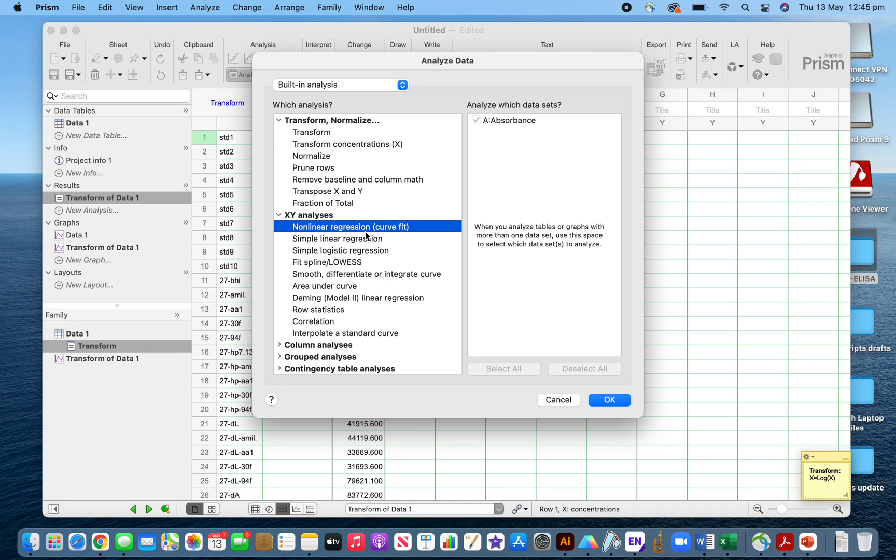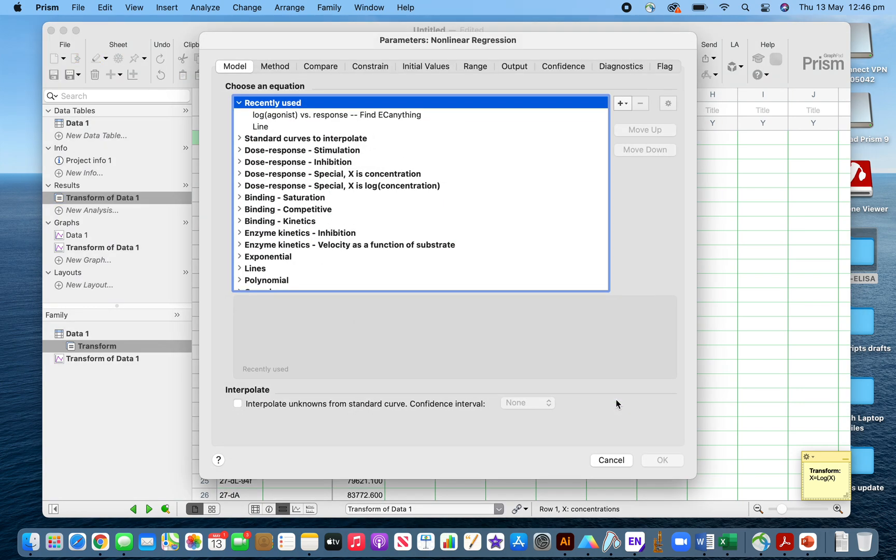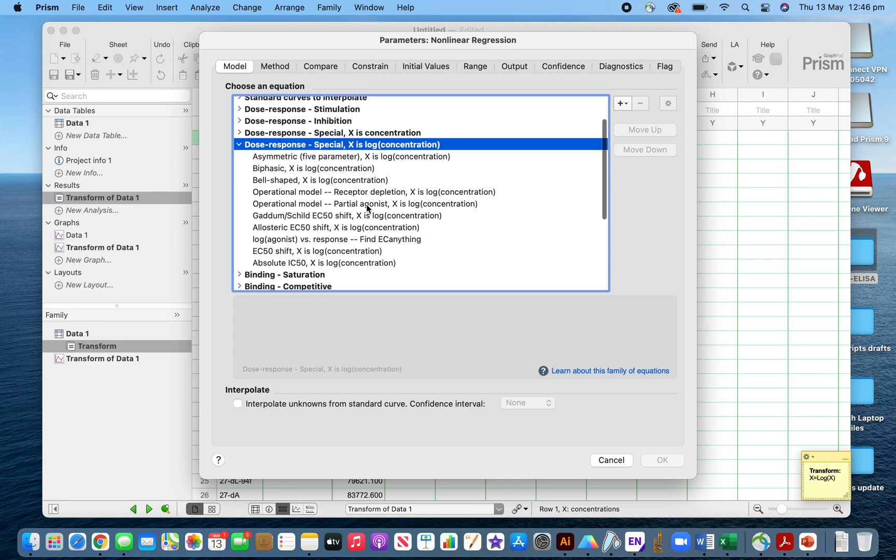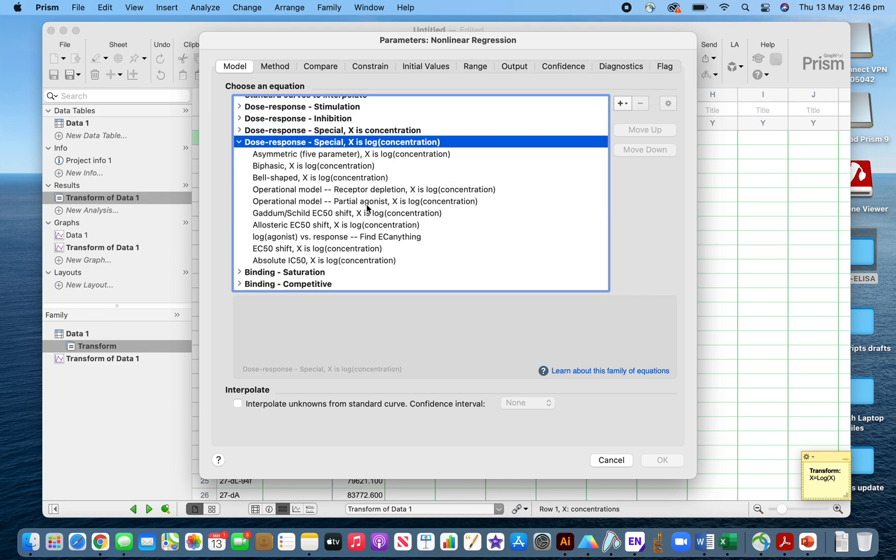I will check after doing the nonlinear regression, because the curve is sigmoidal, it was not linear. I will use dose response, the log concentration, as I transformed my samples to log.